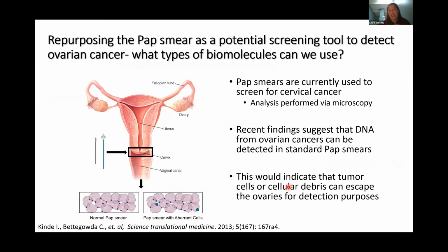And so to do this, we actually thought about repurposing the pap smear. So can we read out biomolecules? And again, I'm going to really say we're riffing off Biotyper here, and the idea that small molecular weight proteins, and in Biotyper, it's really running off the 16S ribosomal proteins, because we know that they're highly abundant, so they're in high copy number and can be ionized in this range. Can we do the same thing, but for women's health?